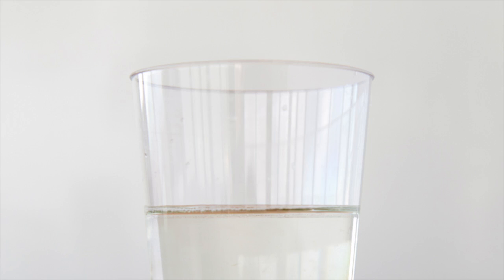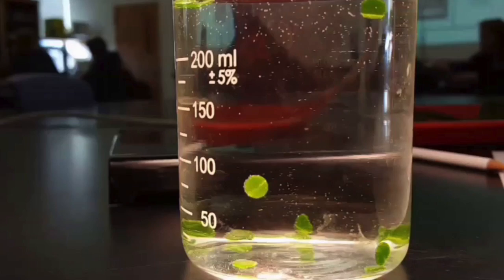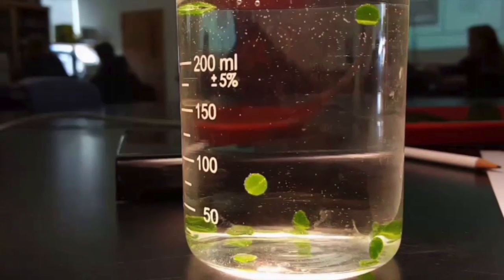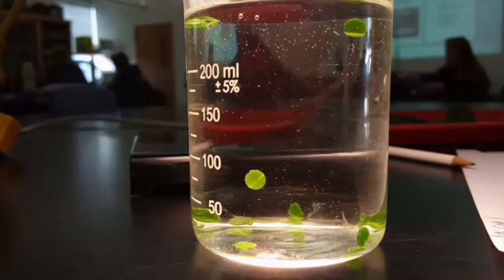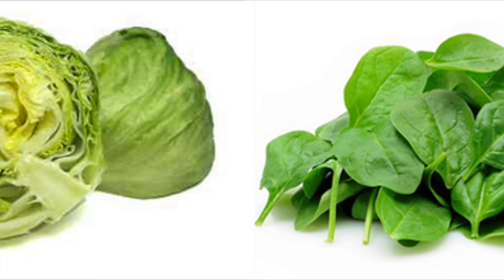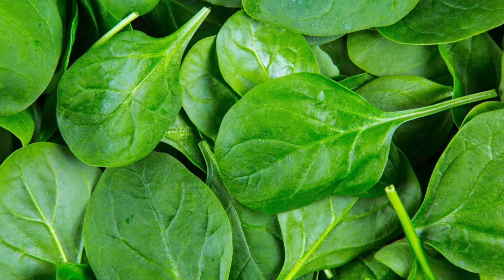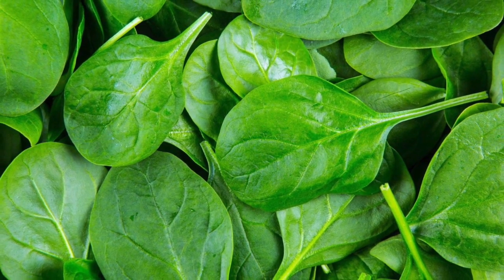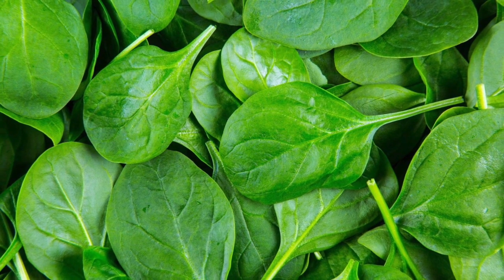In this experiment, leaf discs will be placed in a carbon-containing solution, causing them to photosynthesize and produce oxygen, which will then cause them to float. The rate of photosynthesis will be compared between spinach and lettuce leaves, with the independent variable being the type of leaf and the dependent variable being the amount of leaves that float. It is hypothesized that if both spinach leaf discs and lettuce leaf discs are placed in a bicarbonate solution, then the spinach leaf discs will float more.